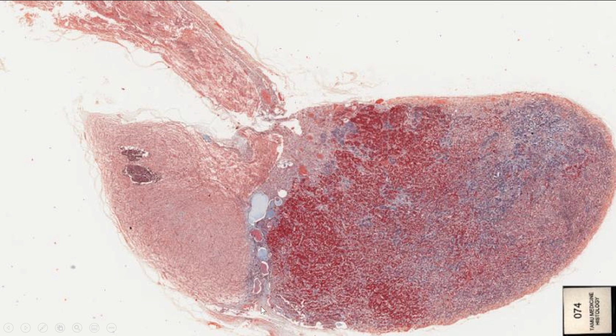And it does secrete some hormones, but we don't need you guys to worry about that. You can think of it as the connective tissue and vessels kind of binding these two together. And then we've got the pars nervosa. So the pars nervosa has a bunch of nervous tissue, right? And it looks like it, and we'll see close-ups of those as well. And then you've got your infundibular stalk. That's what connects the pituitary gland up to the brain above it.